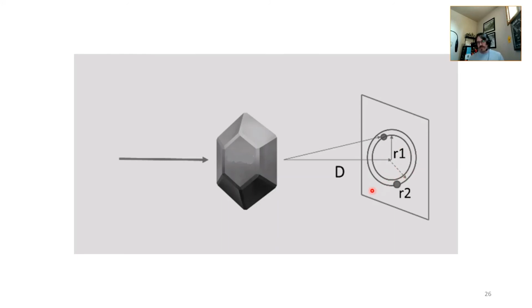The d-spacing of the first order is always going to be greater than the second order, and so forth. So as the rings go out, your d-spacing is actually decreasing. So don't forget that. We'll bear that more in mind when we deal with electron diffraction.